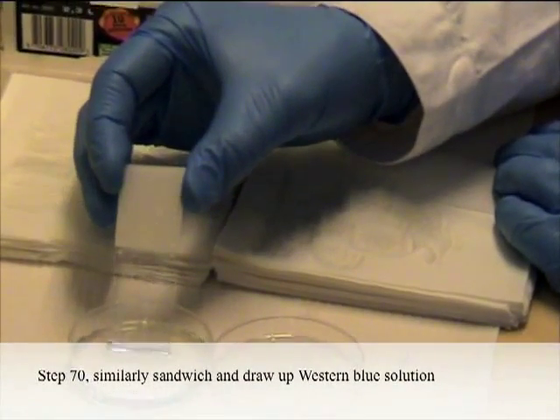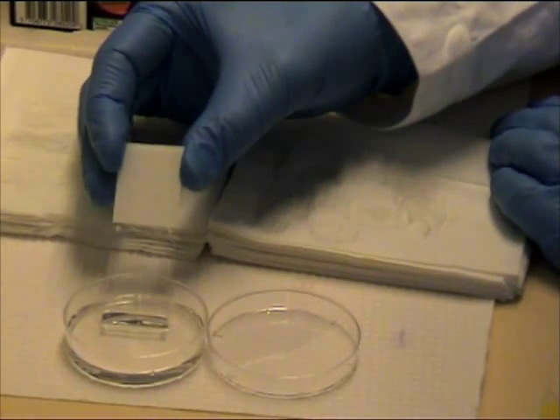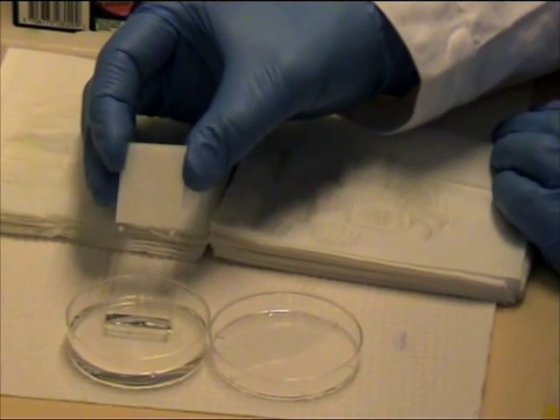Step 70: As before, sandwich and draw up the western blue solution. Notice that the western blue solution is drawn up twice, just as we did for the anti-dig antibody solution in step 65.